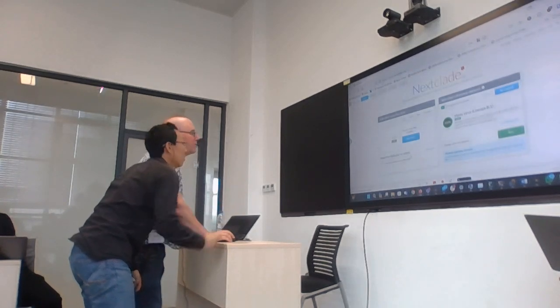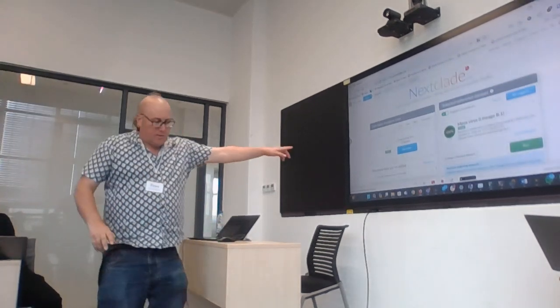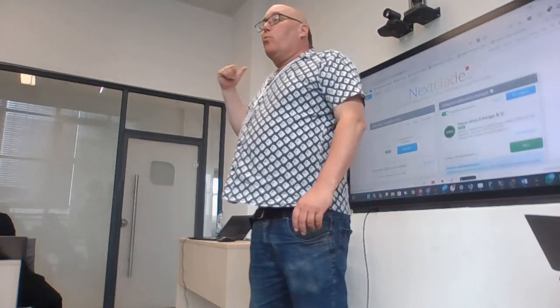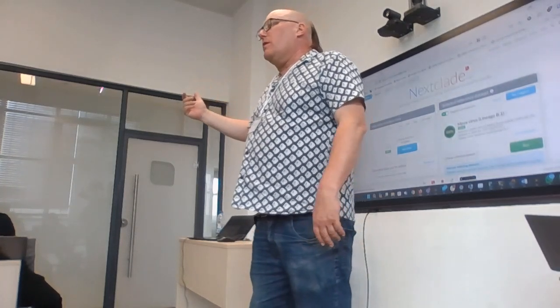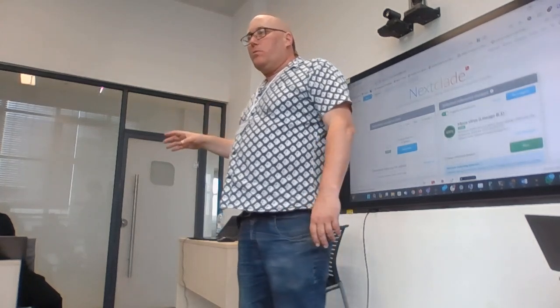So you see it's now been, when I selected file and I added it here, with Nextclade you can analyze more than one file at once. You can load multiple files into Nextclade at once. And by the way, the Nextclade analysis runs in your browser. So the data that you've got never leaves your computer when you're using Nextclade. If you're worried that somebody could be stealing your data, it never actually leaves your computer.